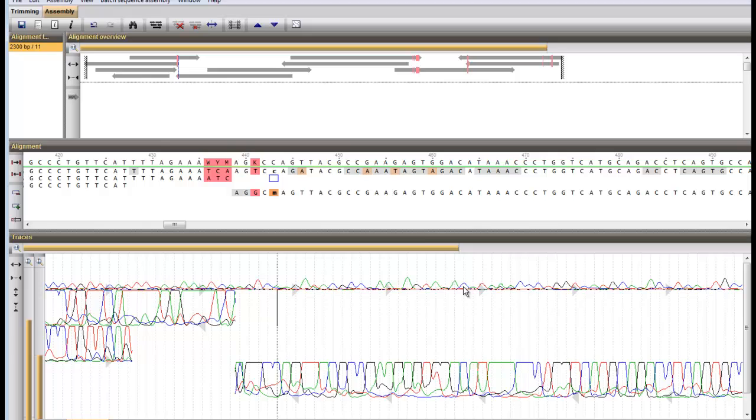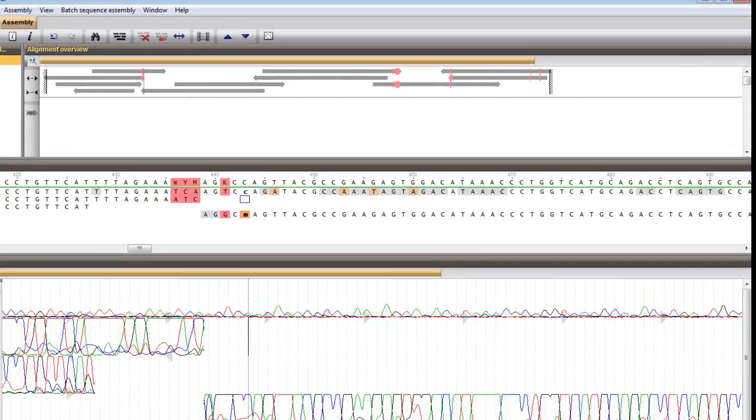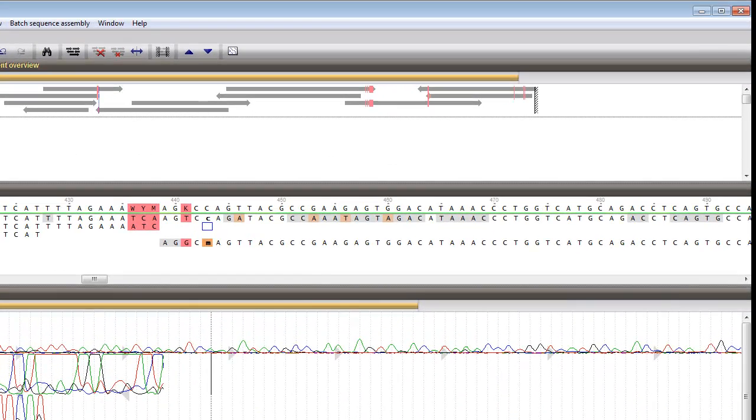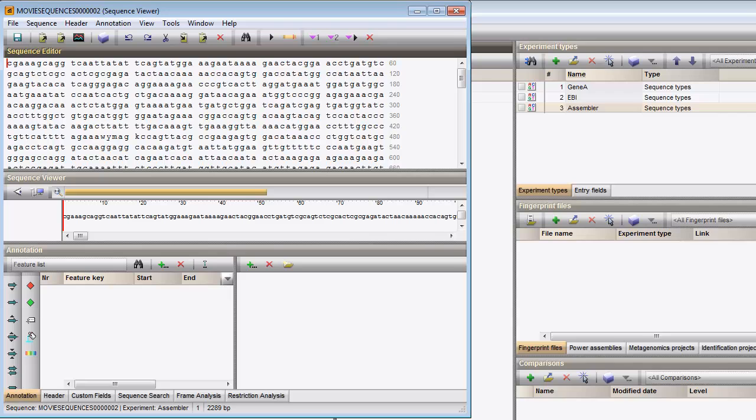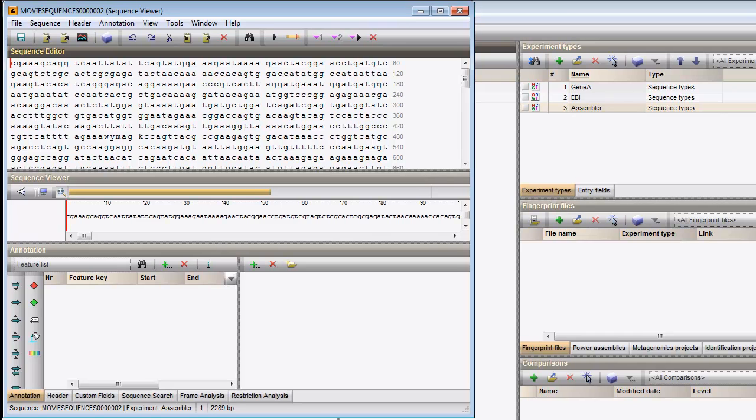When I press the Save button and close the project, the consensus sequence is saved in the underlying sequence viewer window.